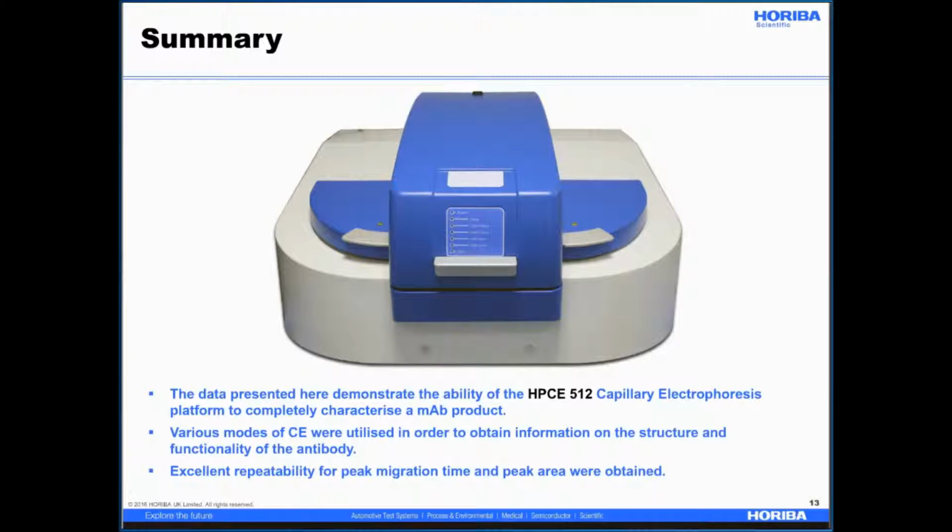The data presented here demonstrate the ability of the HPCE 512 capillary electrophoresis platform to completely characterise a monoclonal antibody product. We used capillary gel electrophoresis and capillary zone electrophoresis to obtain information on the structure and functionality of the antibody samples. We obtained excellent repeatability for peak time and peak area.